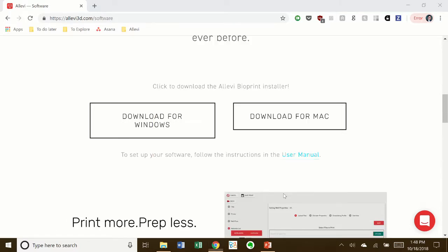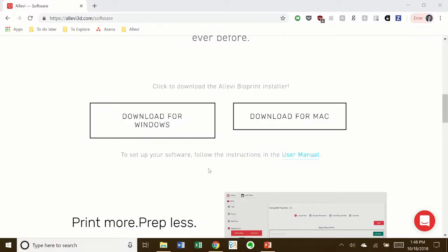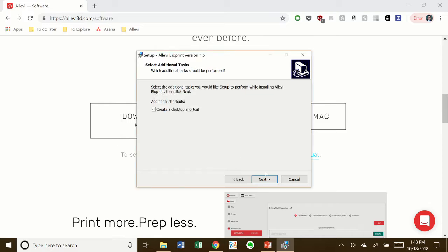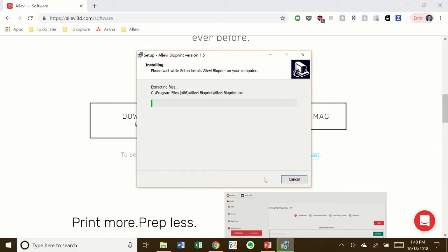If a warning pops up, click Run Anyway. Click through the installer and give the software a minute to install.